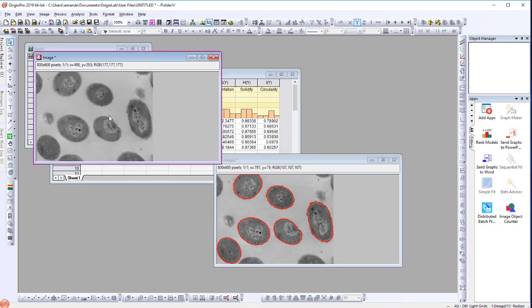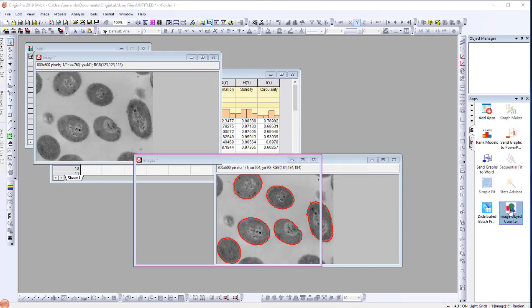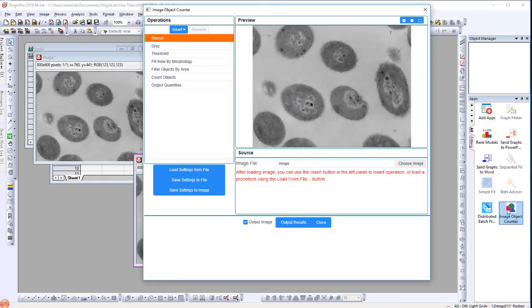If we reactivate the Source Image window and open the Image Object Counter dialog again, the saved operations will be loaded automatically. Thank you.